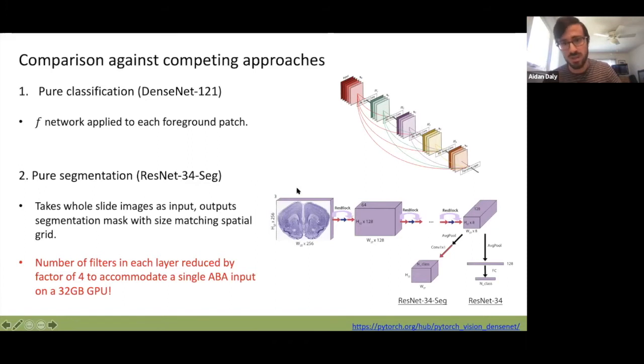So normally ResNet works kind of similar to DenseNet. Take your image, you go through all these different connections, and in a normal case, eventually it flattens it and predicts the class. But in our case, we use this abstracted feature map to predict our registration. So we just map from this feature space onto our desired ST dimensions.